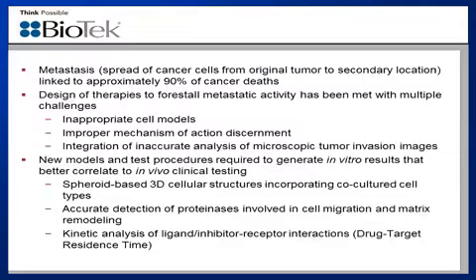These, coupled with sensitive detection and quantification of binding events, changes in tumoroid structures and protease activity, allow for the generation of in vitro results that have a much closer correlation to what is then generated during in vivo clinical testing.